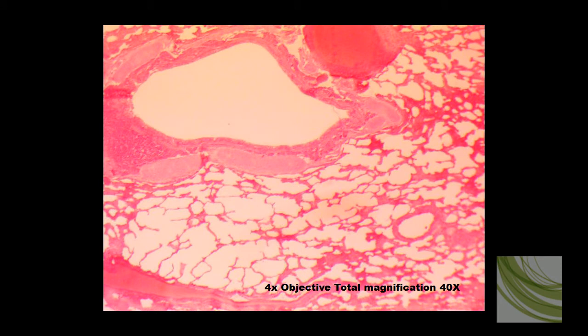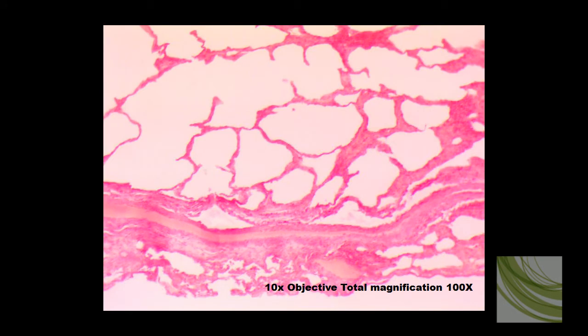Now here we're looking at a lung tissue slide, and the simple squamous — we're seeing this from the side. You can see this area here, the lining of the alveoli, is where we will find our simple squamous epithelial tissue. Here is the 10x objective for a total magnification of 100 times. We can see the alveoli and the little layers of simple squamous epithelial tissue.